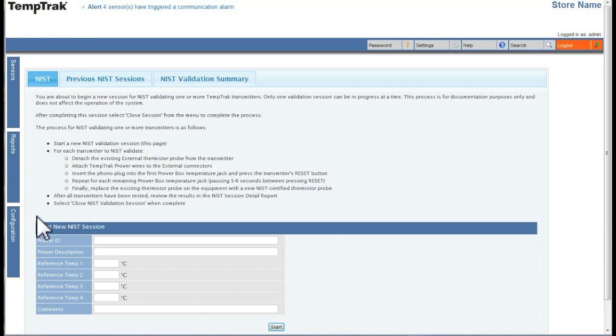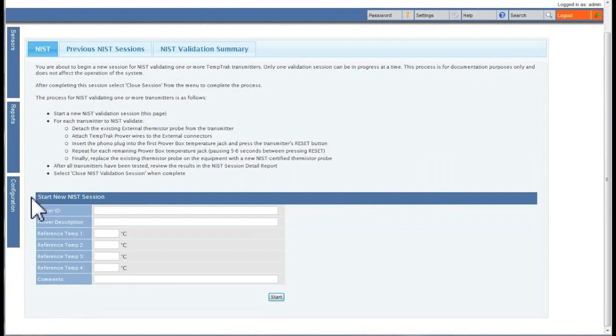You will need to follow the steps outlined here when doing a NIST session. The bottom section will show you how to start a new NIST session.